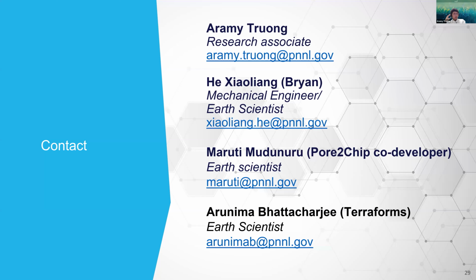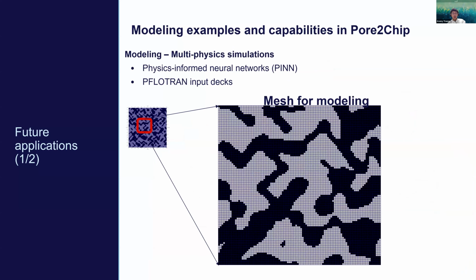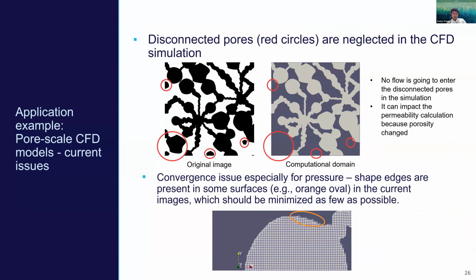I also really want to say quickly, Brian, for the issue of the lone pores in the simulation: in the porous chip design, yes, you can generate a design that doesn't have lone pores. For the sake of this presentation, I gave this one because it'll be consistent throughout the presentation. I understand that, it's a computational issue.